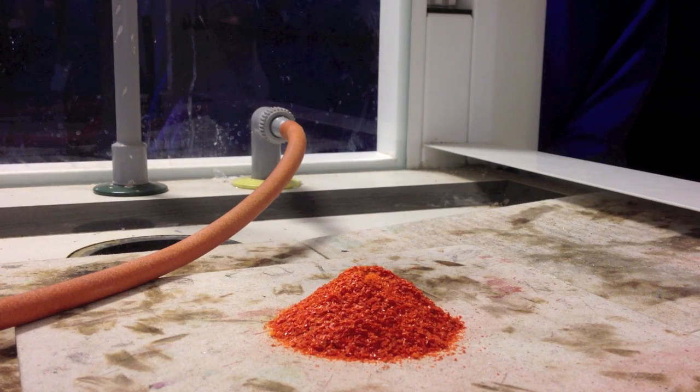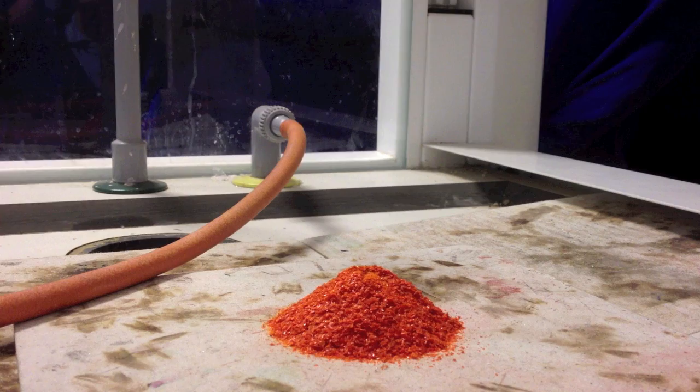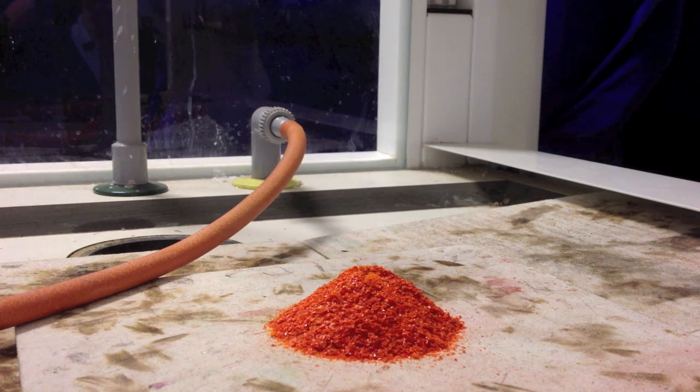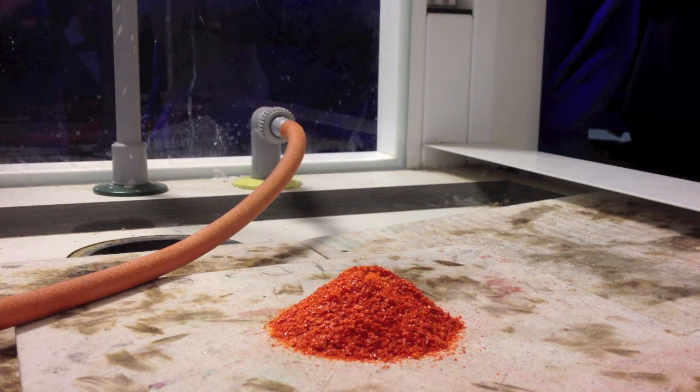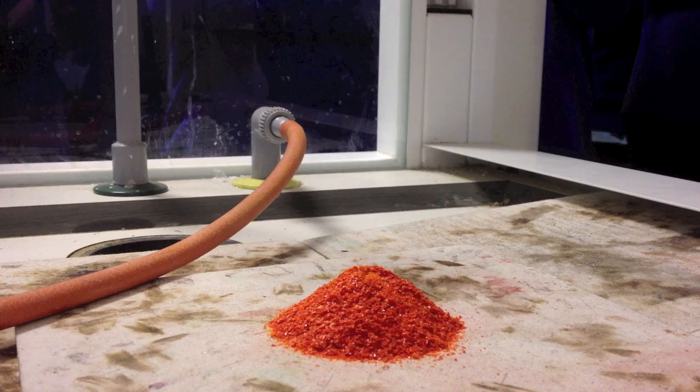What I want you to be watching for is how we know that there's been a reaction with this dichromate. Firstly, how we know whether there's a reaction, and secondly, how we know whether it's exo or endothermic — anything we can spot.